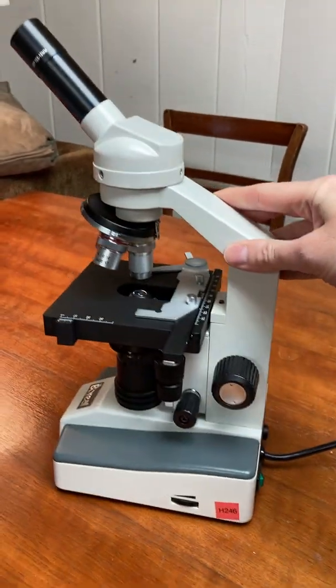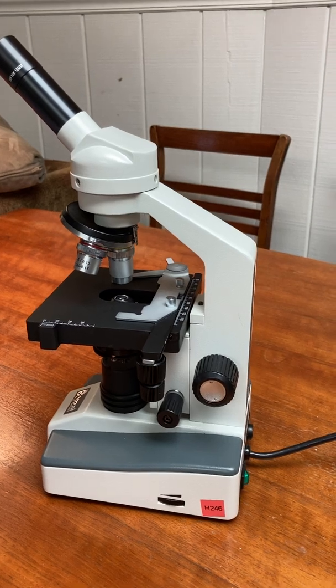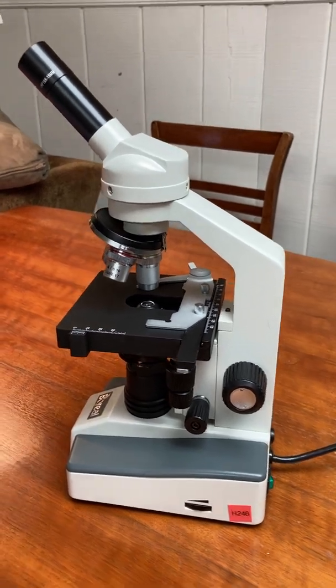This is a microscope that we use at Triton. I'm going to go through the name of the parts as well as the function of each part.